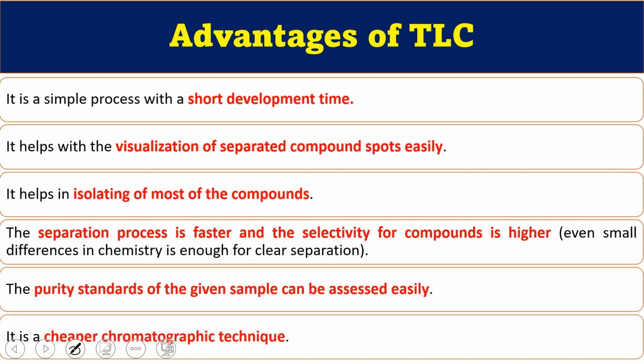You don't require too much instrumentation, you don't require too many components. You require only three things essentially. One is the TLC plate, second is the solvent mixture, and third is the TLC chamber. So it is very cheap and easy to perform.